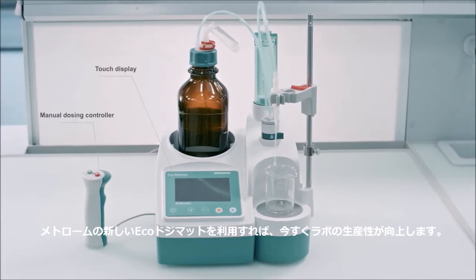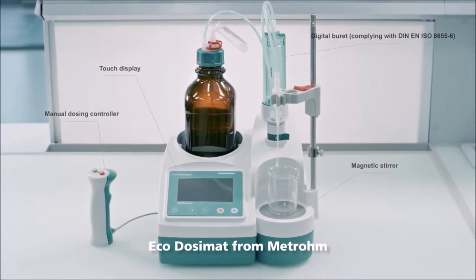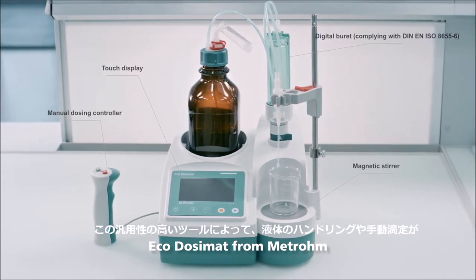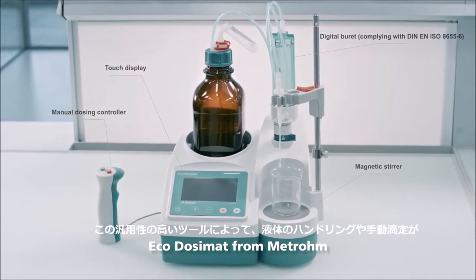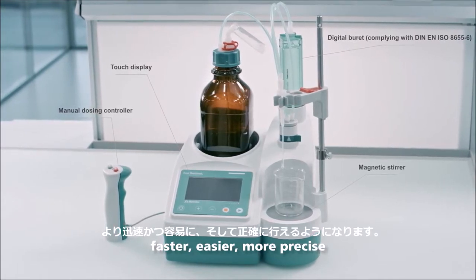Increase productivity in your laboratory now with the new Eco Dosimat from Metrohm. This universal tool makes liquid handling and manual titrations faster, easier and much more precise.